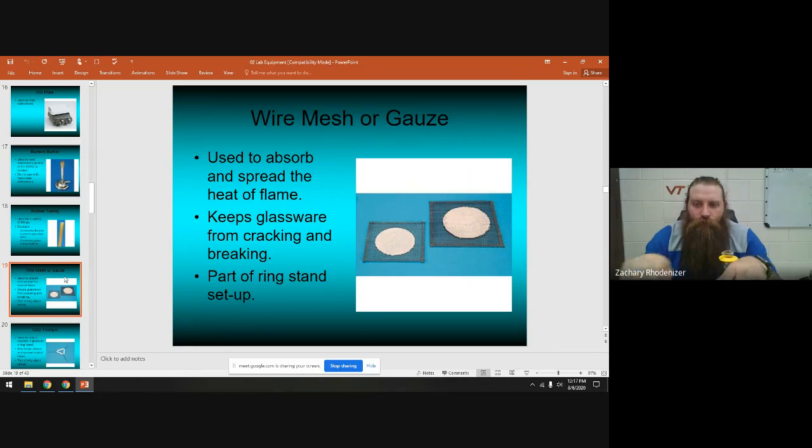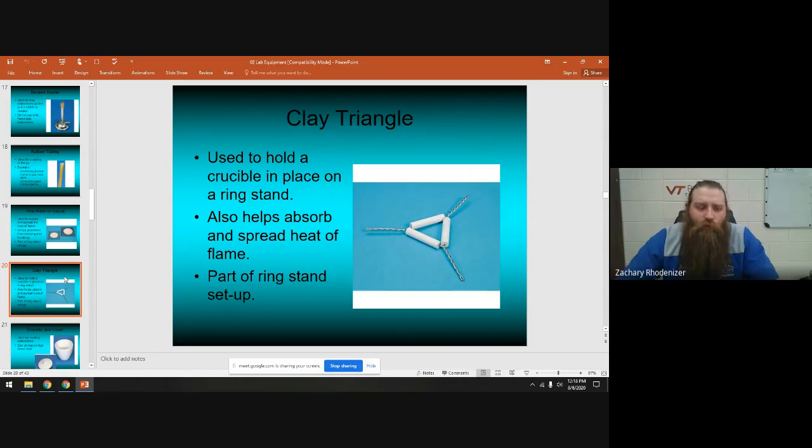Wire gauze is a piece of mesh wire with a white plaster circle in the middle. If you heat something and take it off the heat, don't put it directly on the desk — it might shatter because of the hot glass on a cold surface. Set it on the wire gauze instead. If you're heating with a Bunsen burner and want to disperse the heat, you can have the burner under the wire gauze and whatever you're heating on top — the wire gauze absorbs and spreads the flame's heat.